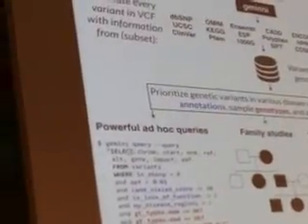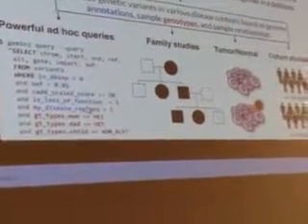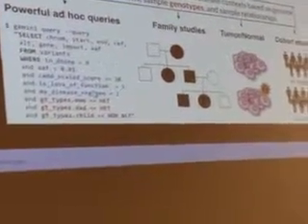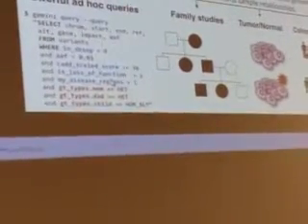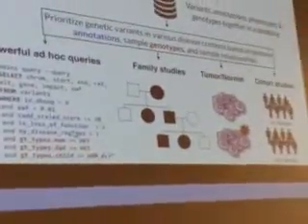And so here at this chromosome, at this start position, it has this particular dbSNP. But what you'll notice quickly is I've got at least 300 columns here of information from all of those databases that you've searched. Now you can sort of say this gets ridiculous quick, searching through this. That's why it's really good to have the ability to understand how to query that database and pull out the information you want versus creating this gigantic text file. And if you look at a genome, this genome file, when you make it as a text file, was 300-something columns with 3.2 billion bases. Not all of them are mutated, of course. Your file is at least a couple of gigabytes, and Excel does not open that. So you really need to understand how to query this if you're going to use Gemini in that sense.